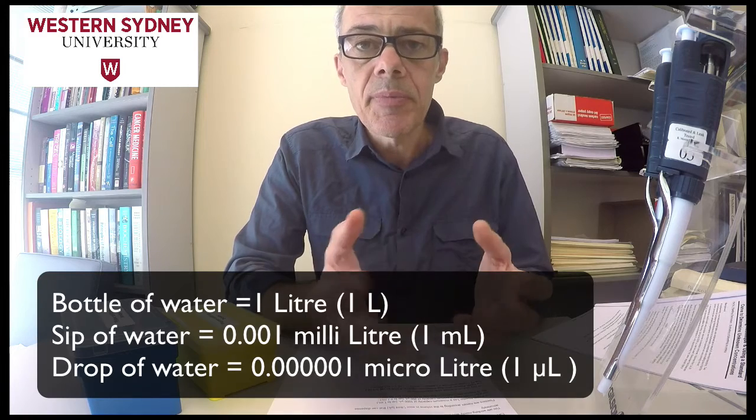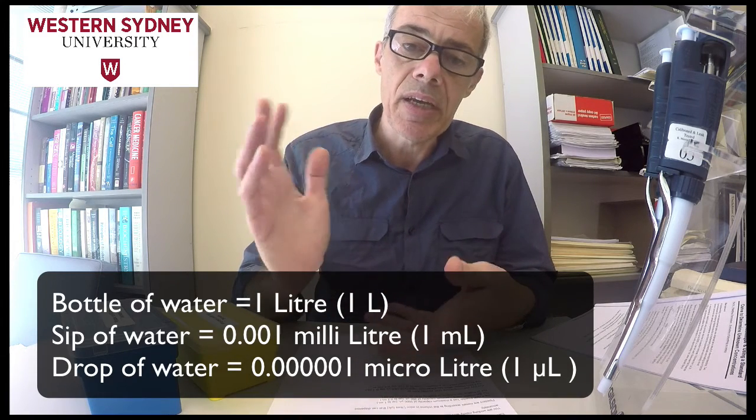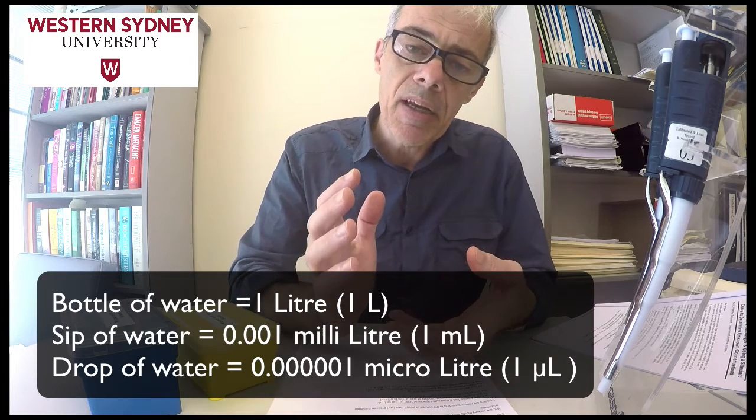Now to understand small volumes you also need to understand the units of volume. So typically we talk about litres like a bottle of water might be a litre, but in molecular biology or biology generally we tend to work in smaller volumes.